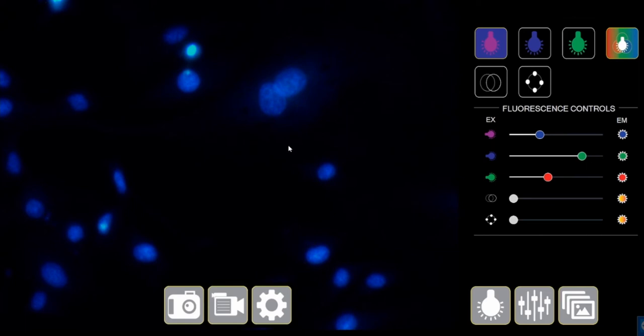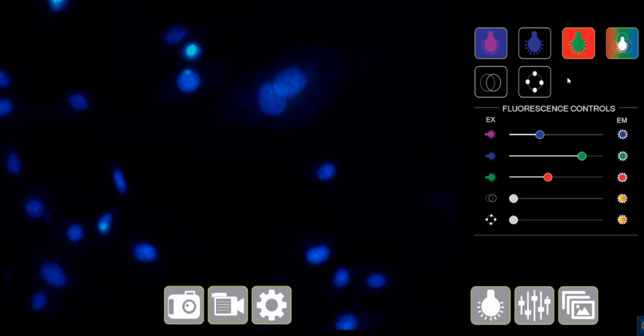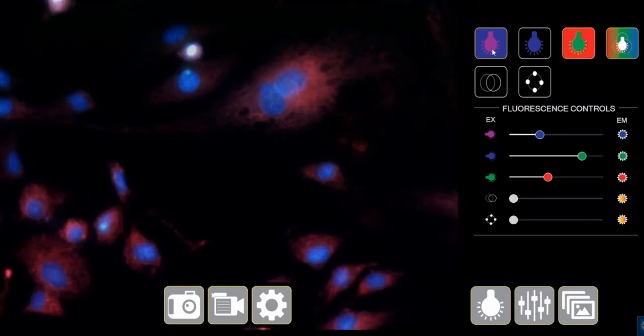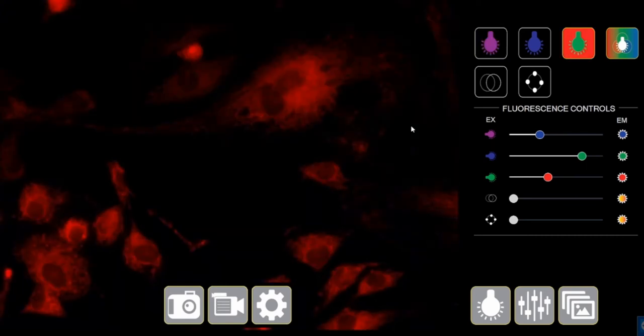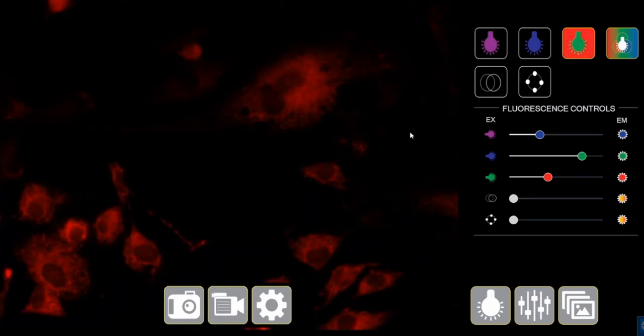And if you notice, there is no crosstalk. There is no bleed through. There is just blue that you see. When I add my red channel, that's just red. I turned off DAPI and you see there is no crosstalk by DAPI.